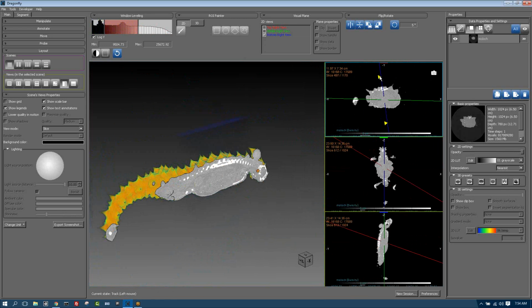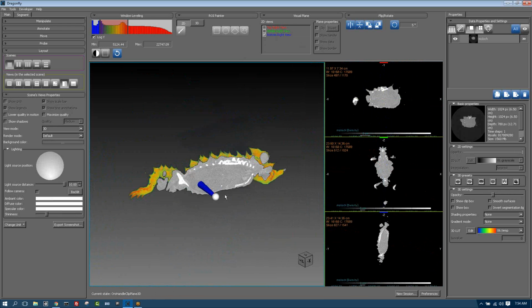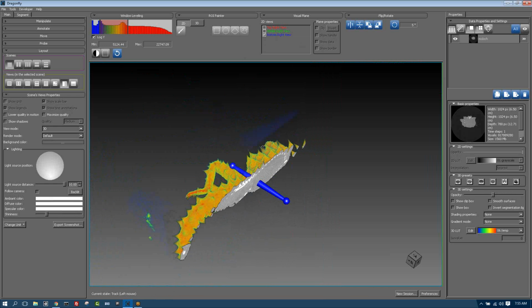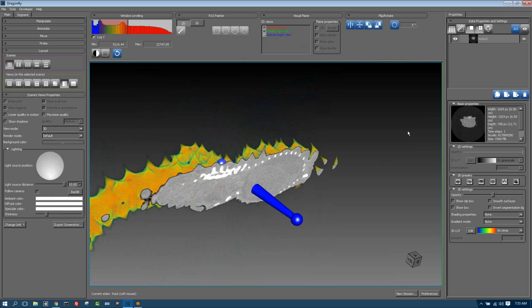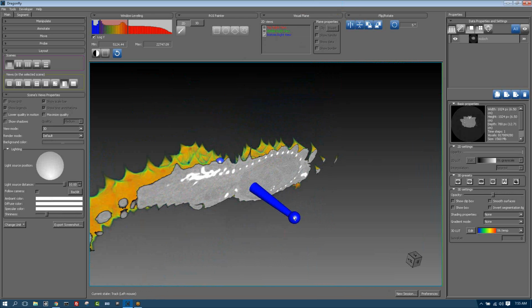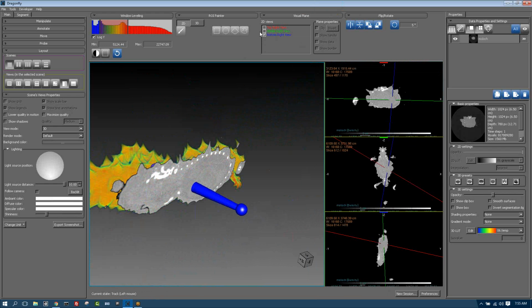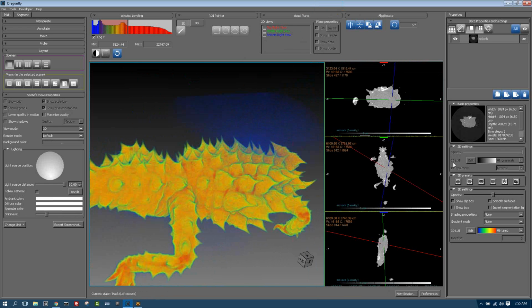So with that blue view, now I could tip it and try and make it a more perfect sagittal section. I can adjust where it is in the 3D view by dragging like this. Also, if you're working in the 3D view, you could just select it and click Show Handle, and now you have a handle in the 3D. One of the things I don't think I've mentioned yet is that any one of these views you can double-click on the screen to make it full screen. So you might be working in the 3D screen and not have the 2D views accessible, and that's a case where you might want to do dragging. So you can tip the oblique plane with the tip of this ball just like you could tip it over here. I'll go ahead and turn off my views.